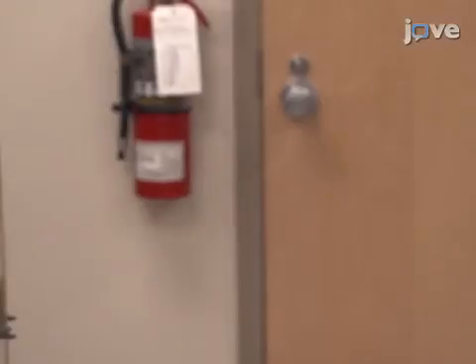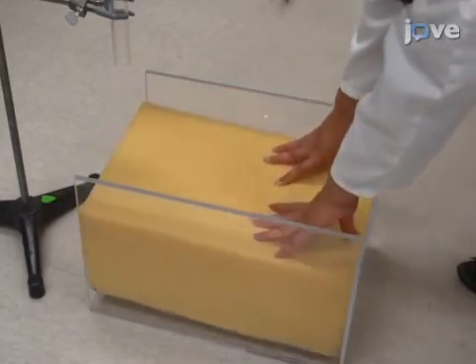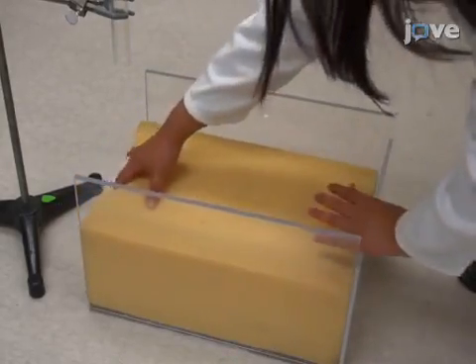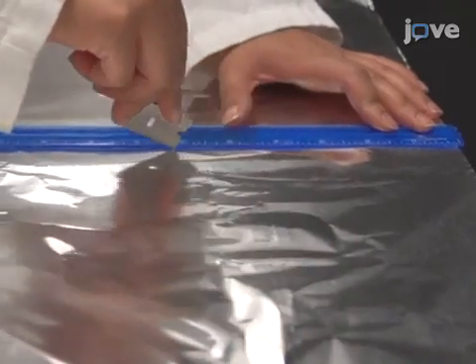To set up the mild traumatic brain injury apparatus, construct a U-shaped stage made of clear plastic. Place a sponge at the bottom of the stage to collect the animal after it falls. Next, score a piece of tin foil with a sharp razor blade.